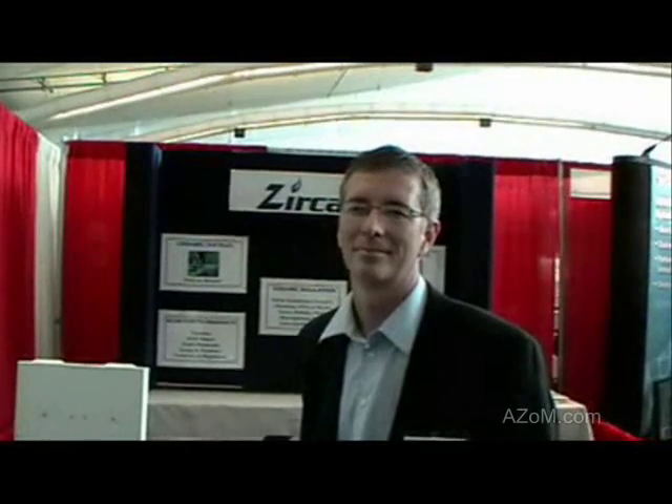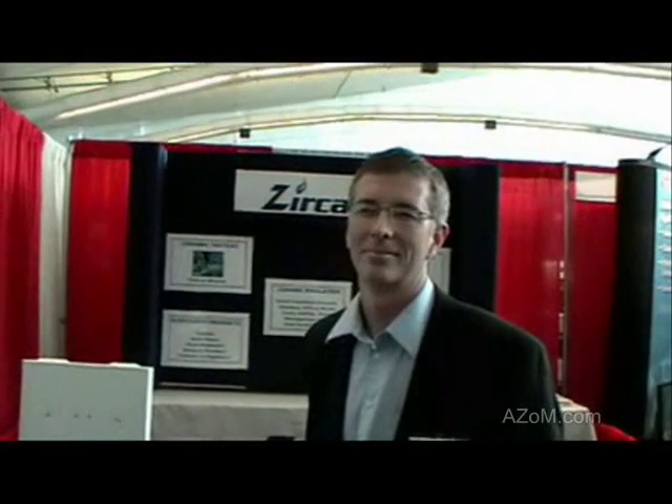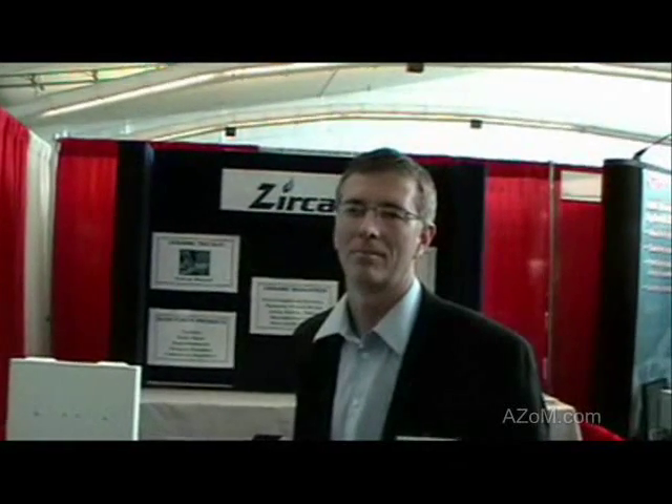This is Cameron Choi from AZoM.com, and I'm speaking to David Hoskins, who's the sales manager for Zircar Zirconia, and he's going to tell us about their Hotspot 110 furnace.